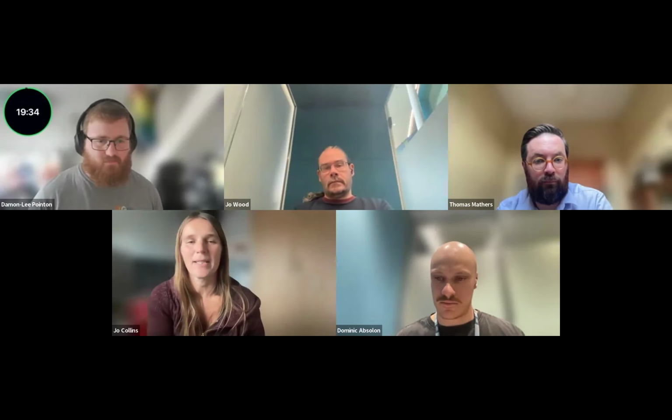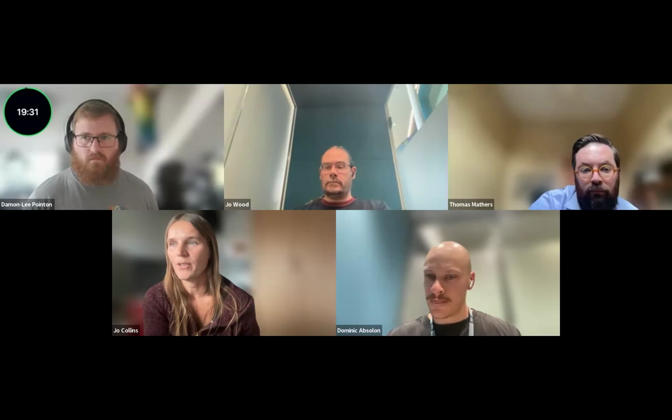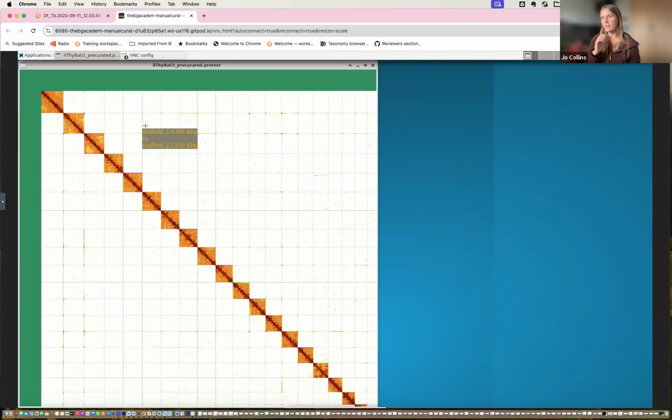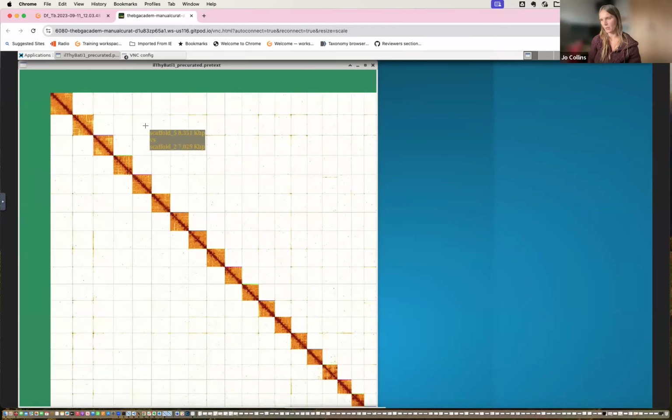Thanks, Dom. Right, so hopefully everyone has managed to get their pretext map open. I'm just going to start sharing my screen now. Hopefully you see my pretext map. Is that what everybody's seeing? Yeah, cool. Okay, so as Dom mentioned, if you've got quick questions as you go along, if you can pop them in the Discord channel, that would be great. And then hopefully the other curators can answer those for you as we go along.